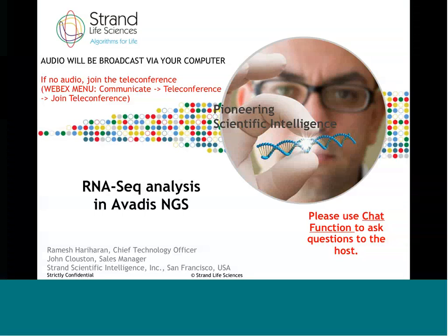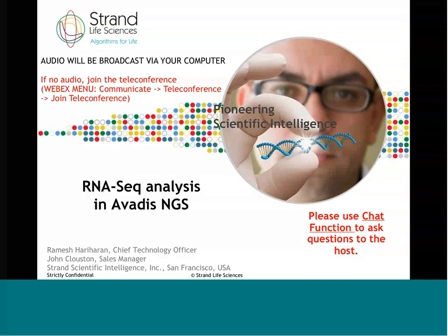Today's session is about RNA-Seq analysis using Avadis NGS. The speaker is Ramesh Hariharan, the Chief Technology Officer of Strand, and today he will be demonstrating the key analysis endpoints that you can achieve using Avadis NGS.